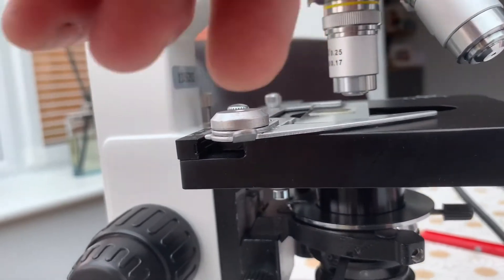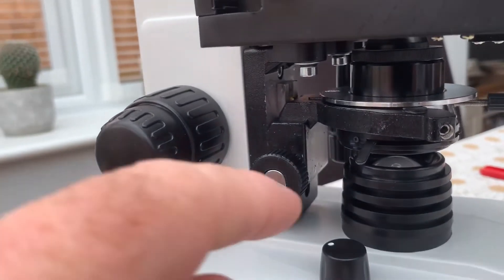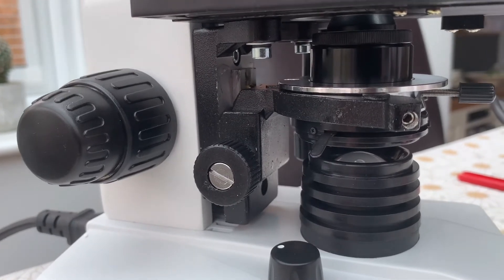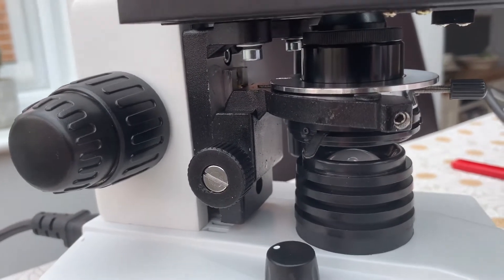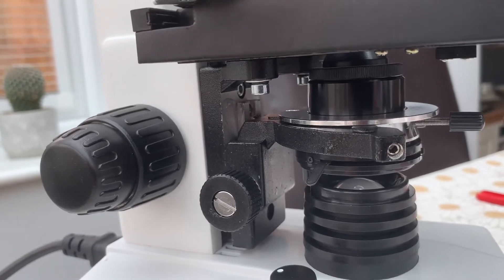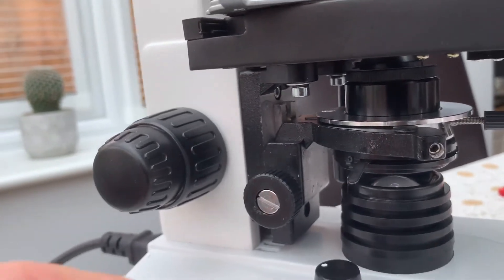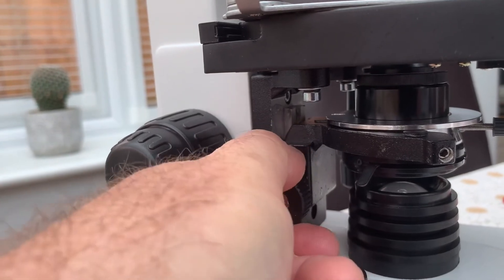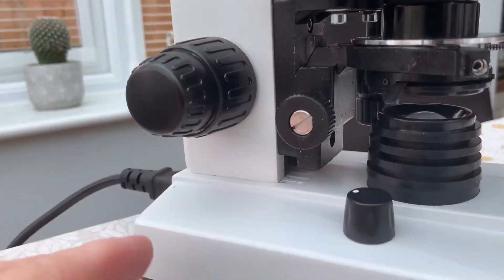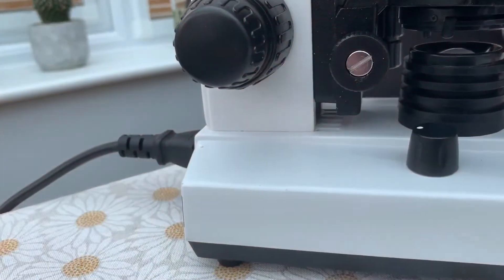The iris diaphragm is something you have to play with — each objective has a different height setting for the iris. You can also pop different colored slides in there, which isn't really necessary for koi keeping but is a handy feature if you get into microscopy. The iris diaphragm isn't essential but is a useful tool. You control the height of the iris with this knob. Then you want a nice sturdy, weighted base to keep it well planted.